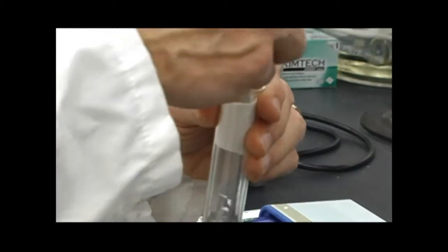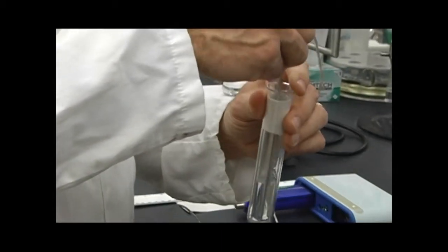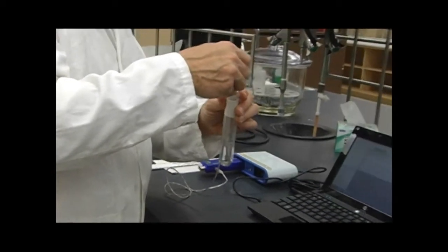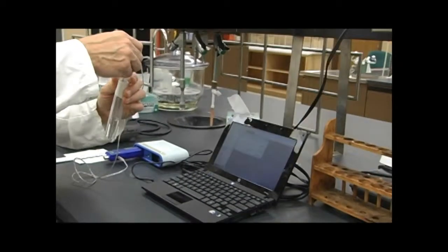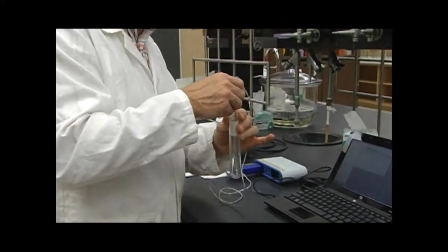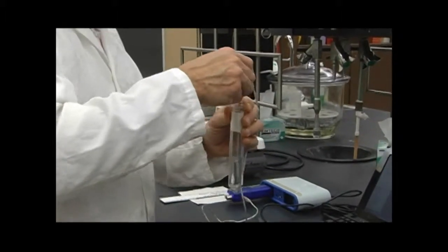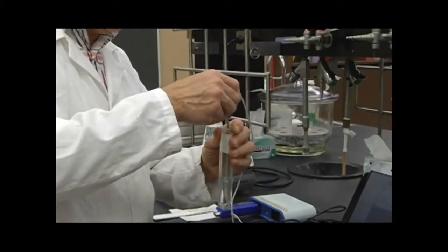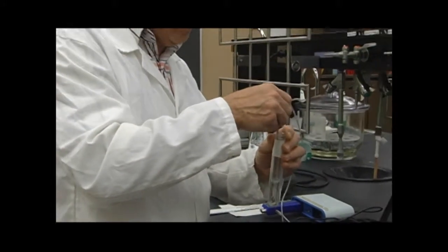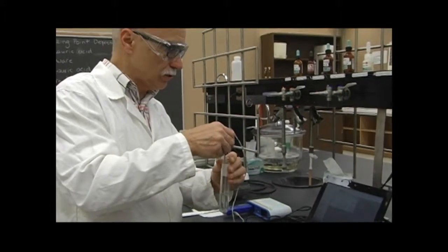Well, we are down below the freezing point of pure lauric acid, so our hypothesis and the science is coming true. So we're at 41.5 and no indication of slush yet. So the amount that the freezing point gets depressed is equal to the constant of lauric acid times the molality of the solution.